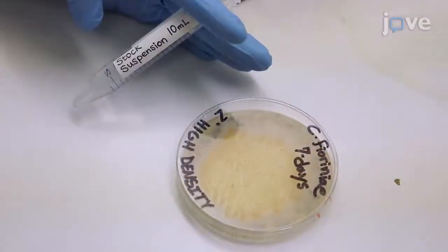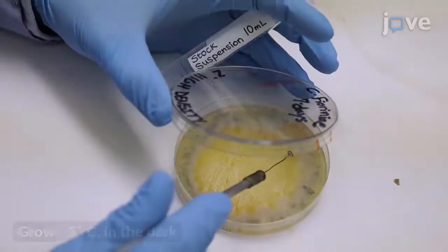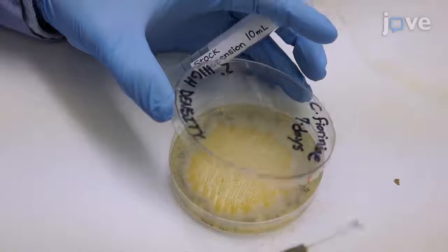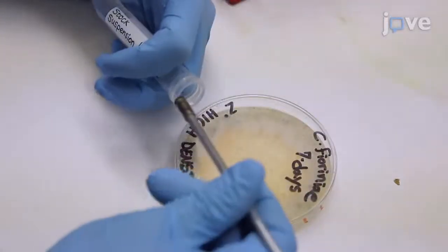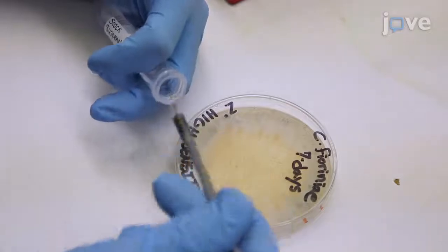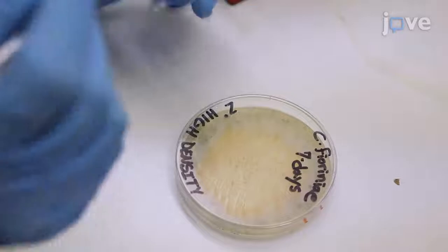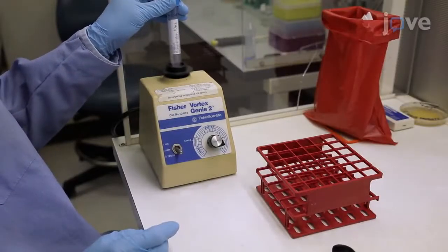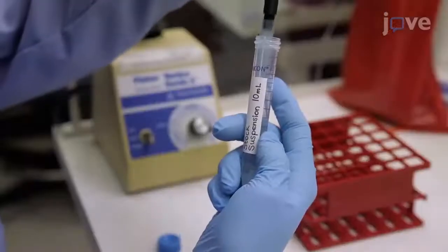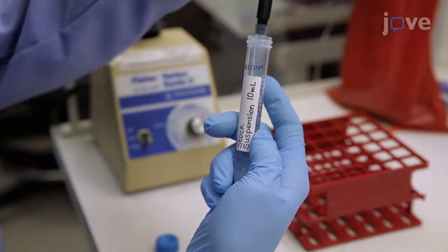After 7 days of growth, use a standard sterile loop to gather a small amount of conidia from the high-density culture by lightly touching the loop to the conidial mass. Stir this into a 15 ml centrifuge tube containing 10 ml of sterile deionized water. Vortex this sample for 10 seconds. Using a standard pipette, plunge up and down numerous times to further mix the sample.